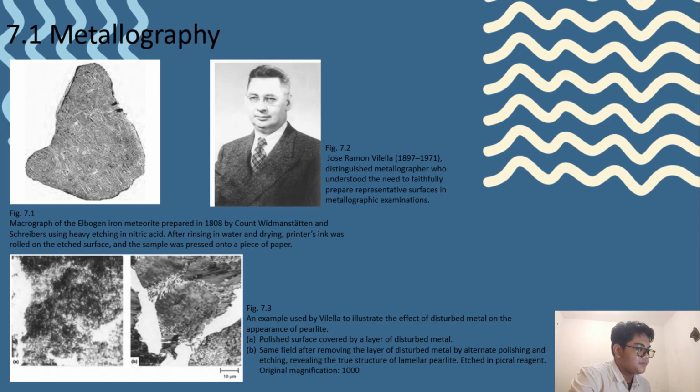We have 7.1 metallography. Metallography is the scientific discipline of examining and determining the constitution and the underlying structure of the constituents in metals and alloys.